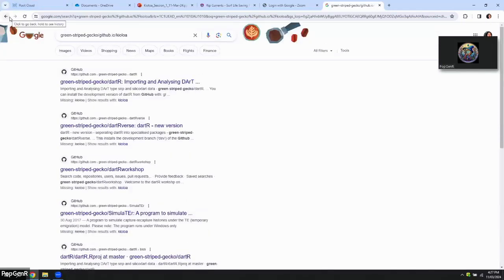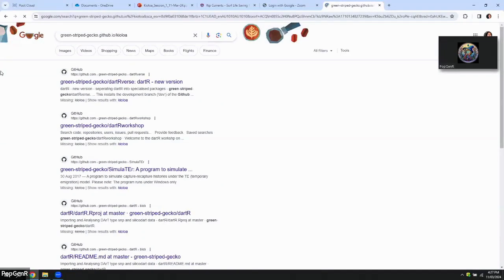Basically, I try to find the link. We have produced an HTML file from all the sessions, and there was an email, and I just can't type the link because I'm not clever enough. I think there's a dot in there, and then it could work. And then you have all the code in there as well. So if you have space on your screen, you could have this HTML file to the right, and RStudio to the left, and then you could copy paste from there.